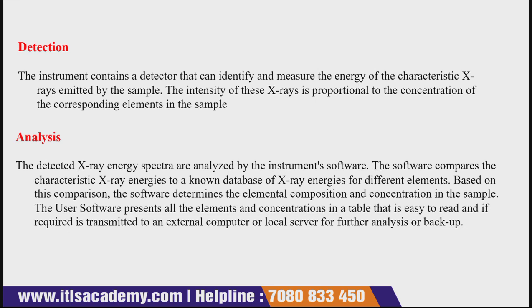The instrument contains a detector that can identify and measure the energies of the characteristic X-rays emitted by the sample. The intensity of these X-rays is proportional to the concentration of the corresponding element in the sample. Now comes the analysis. The detected X-ray energy spectra are analyzed by the instrument software.